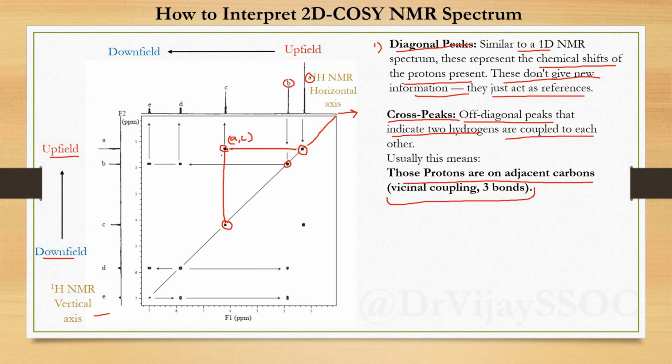Sometimes we see several other cross peaks. So how to identify the real cross peak? The best way is that the first half of this spectrum is exactly the mirror image of the second half. Whatever you are seeing in this area, you will see in this area also. Now you can clearly see that if you draw the vertical line, it is connecting to another dot here, right?